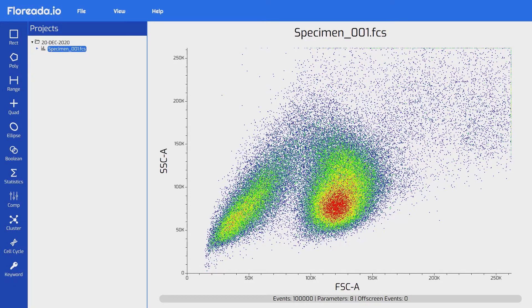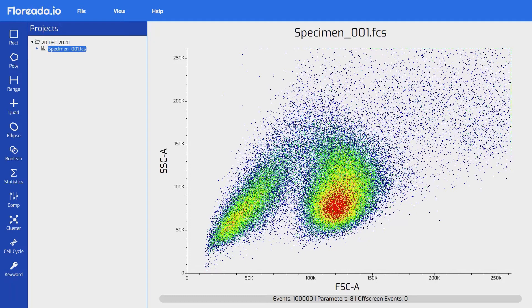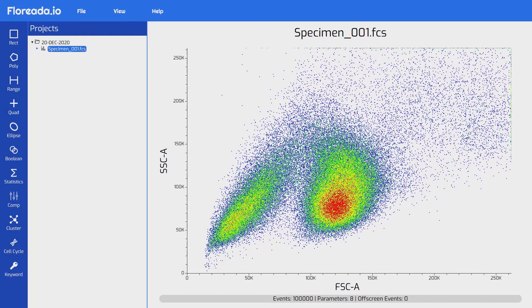On the right side, we have a dot plot with forward scatter on the X axis and side scatter on the Y axis. At the bottom, we have the event count for the file, the number of parameters in the file, and the current number of off-screen events. That last one is useful to tell us if we may need to adjust the axis.